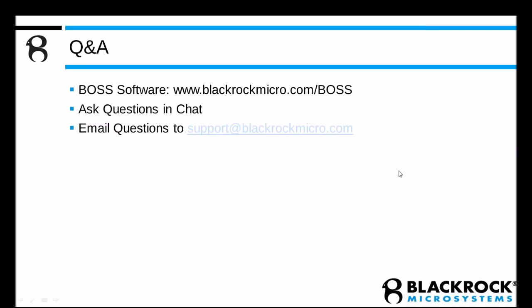Another question is, does it import online sorting? If I understand that question correctly, a lot of users might do online sorting of their data so that they can trigger off certain units, or just to get a head start on sorting the data when they load it into an offline sorter. And BOS can definitely accept those types of files. BOS does not currently accept live data from the neural signal processor.